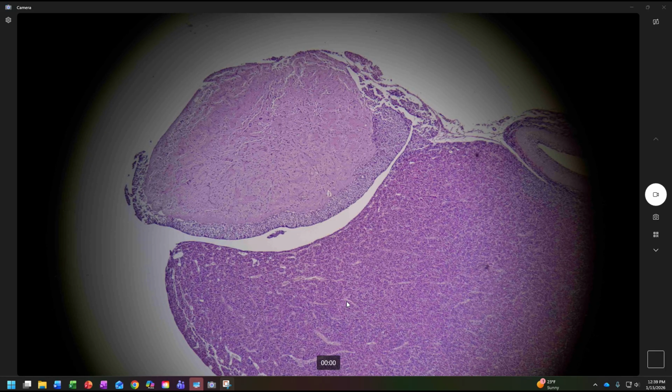And then we need to differentiate between which one is the anterior pituitary and which one is the posterior. The anterior pituitary is the one that is darker, more grainy. The cells are packed more tightly together. The posterior pituitary is going to be the one that is a little more wispy. It's going to be a lighter color, less dense than the anterior pituitary.